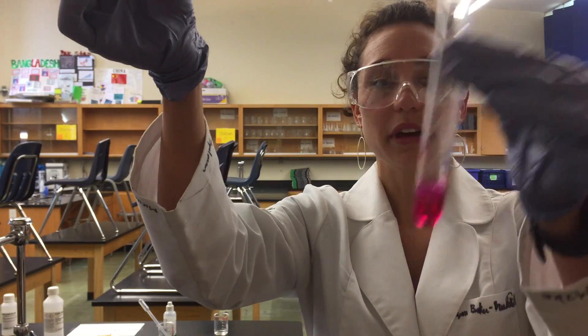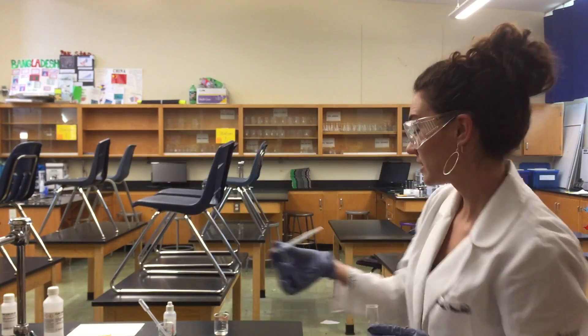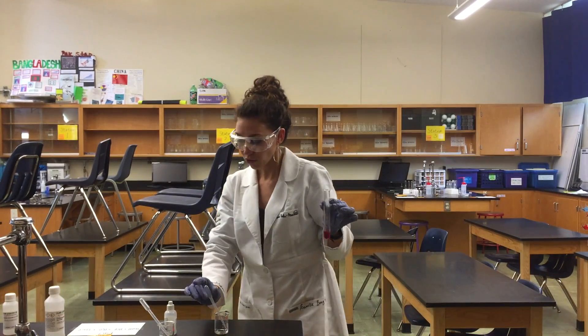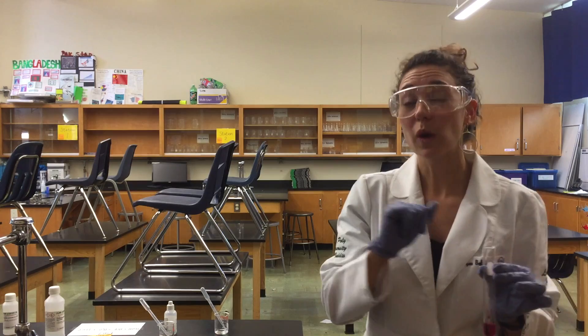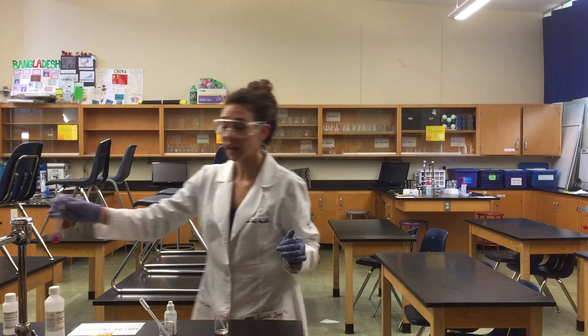And there we go — very pink. So our products when we combine sodium hydroxide and hydrochloric acid: we make two products, water and NaCl, sodium chloride.